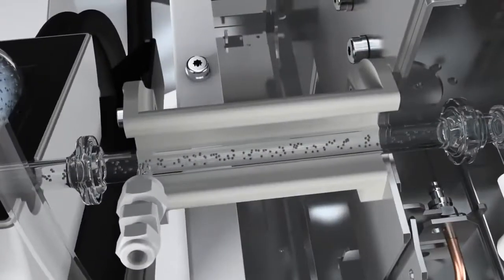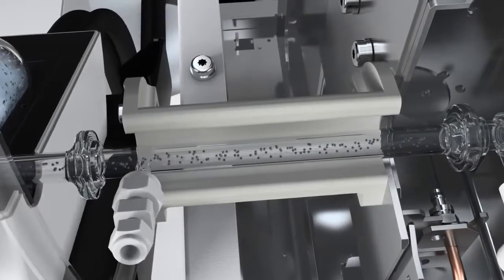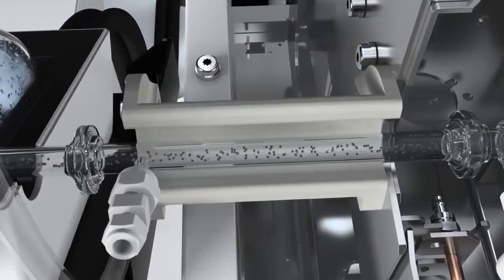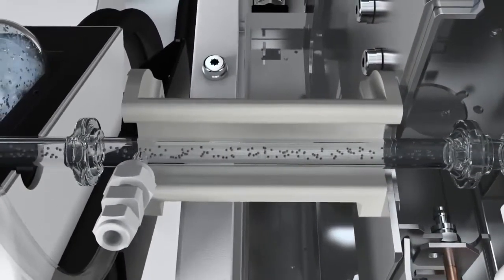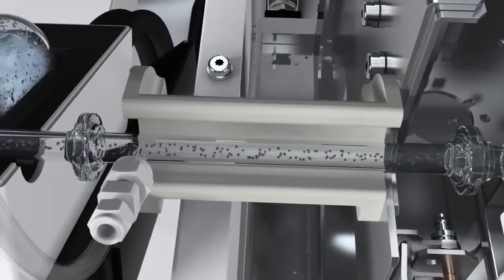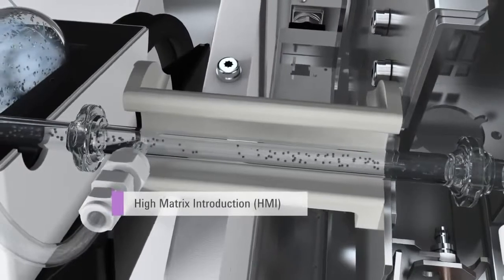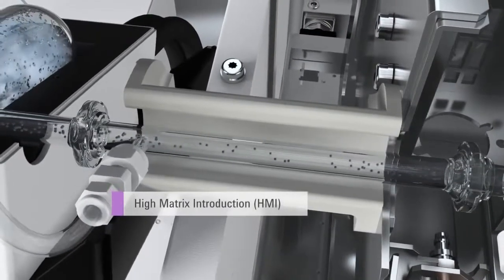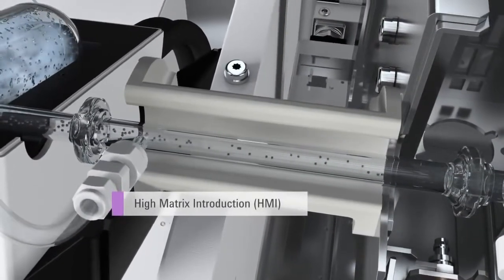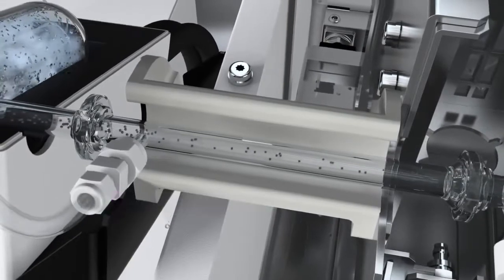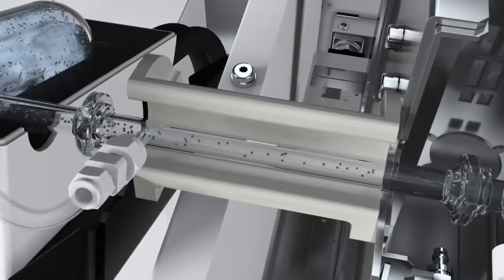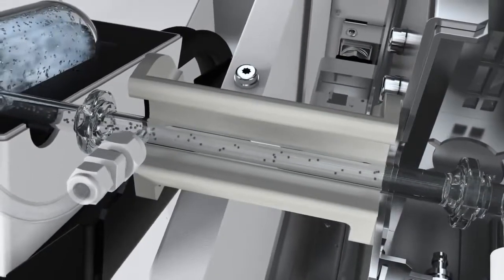The 7700 delivers the best matrix tolerance, lowest interferences and highest ionization of any commercial ICP-MS. Now, Agilent's innovative HMI, or High Matrix Introduction Technology, further extends the matrix tolerance of the 7700X and allows percent-level matrices such as undiluted seawater to be measured routinely.